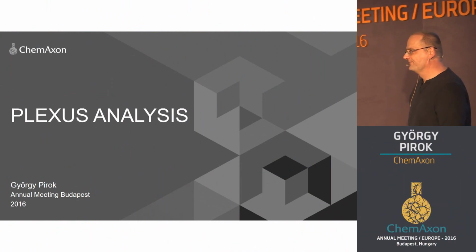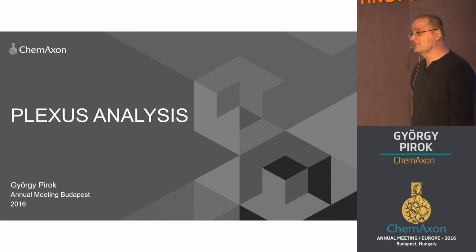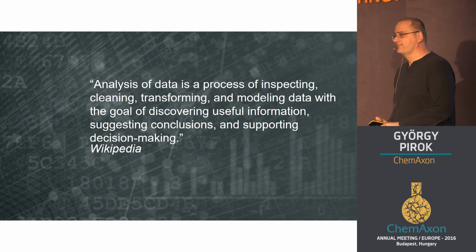Hello, good afternoon. I would like to talk about something new. It's called Plexus Analysis from ChemAxon. This is a new product, and it's about data analysis.